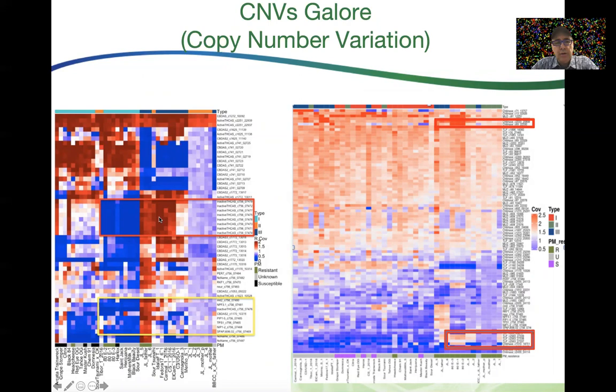You can see amongst these many different cannabinoid synthase genes that we have in the genome that there are a lot of areas that are duplicated or deleted with respect to the reference sequence. That's very interesting to us because some of these deleted genes, particularly the ones here, are the cannabichromene synthase cluster. And on those same contigs in phase are these genes down here. Some clients want to breed for deletions of cannabichromene synthase because they're afraid it's a sloppy enzyme and it can also make a little bit of THC. There are limitations on how much THC your plants can have, so paying close attention to all the cannabinoid synthase genes in the process of breeding is really critical.